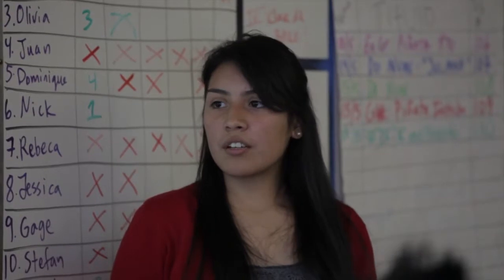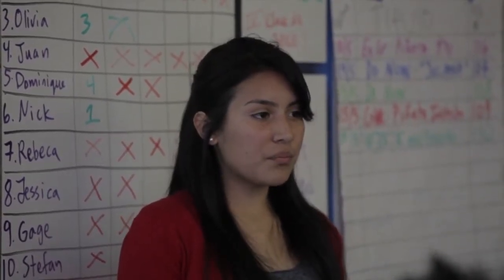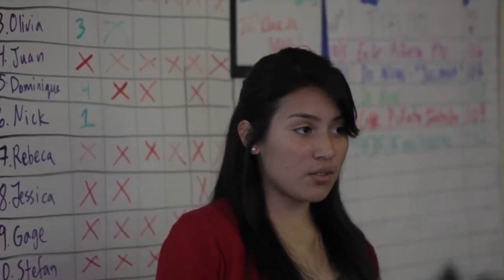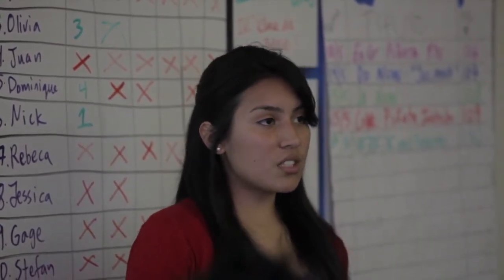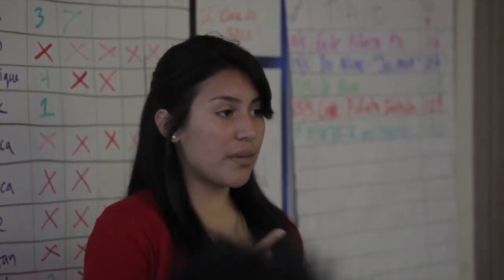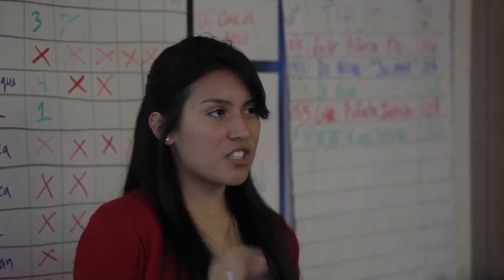Another source of error was the timing, when you stopped. It was a human error, because we had the same person stop it and start it every single time to try to avoid that. But also it's hard to be right on the dot, especially when it's seconds. And so sometimes we did go a little bit over, a little bit less of how much we timed the magnetic stir. And so that was another error that changed the data a little bit.